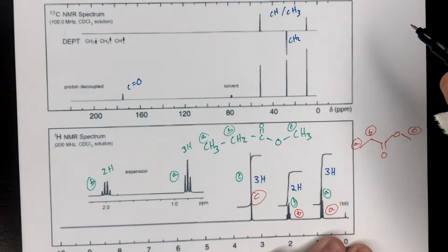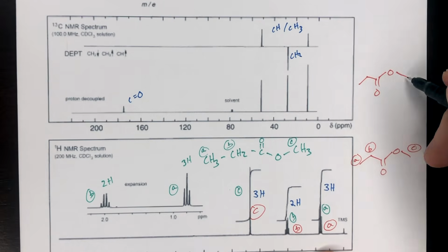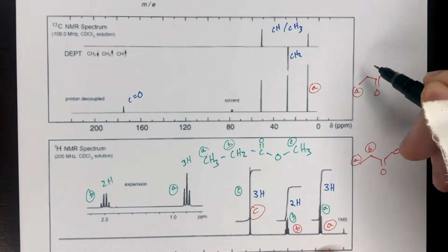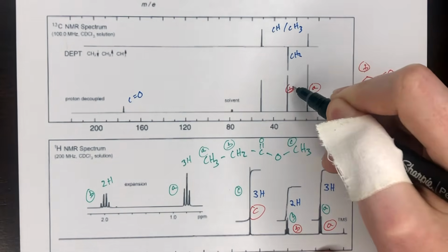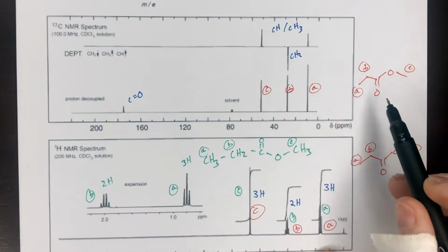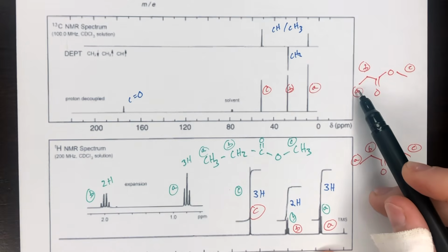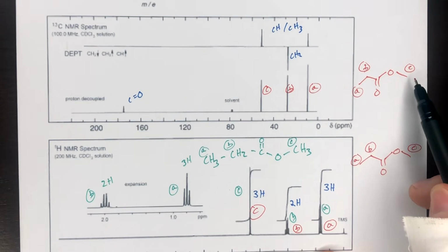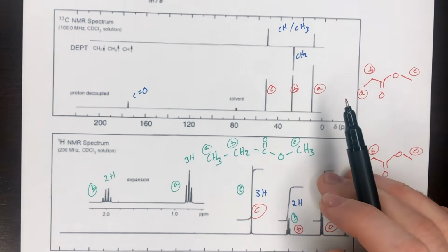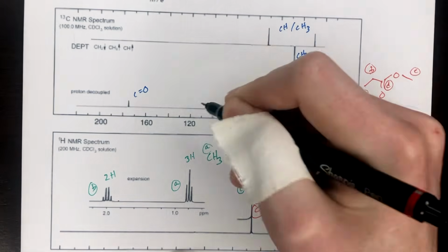And then going back to our C-13 NMR. Here, this is A, this smallest signal here is B. And then like I was mentioning when I was first interpreting this, the difference between A and C is significant. And that makes sense here because we just have a carbon bound to an alkyl group versus a methyl bound to an oxygen. That's a significant difference there in the shielding, in the chemical shift. And then lastly, we have our carbonyl.